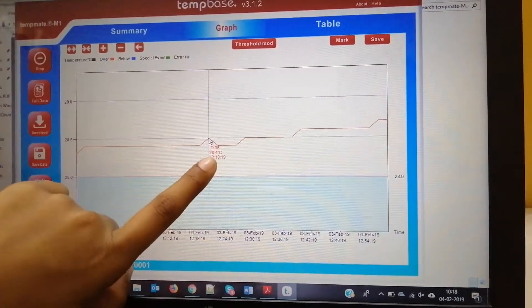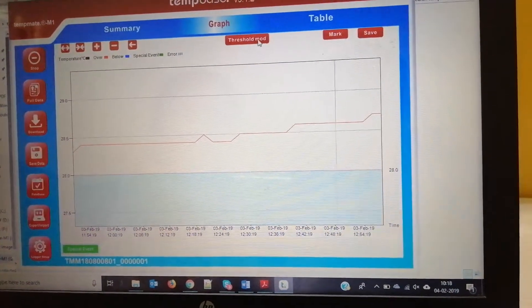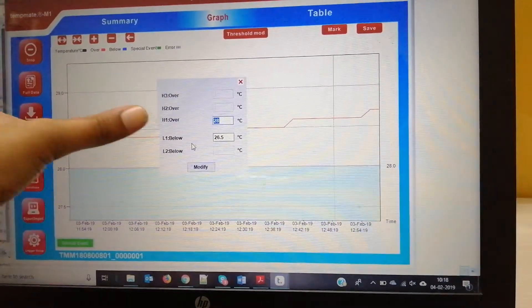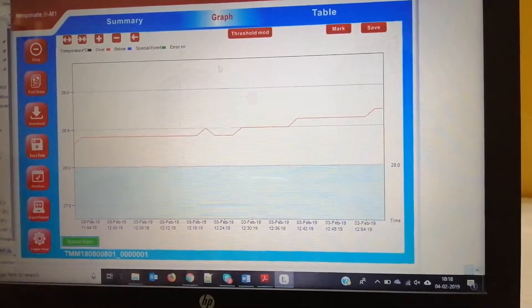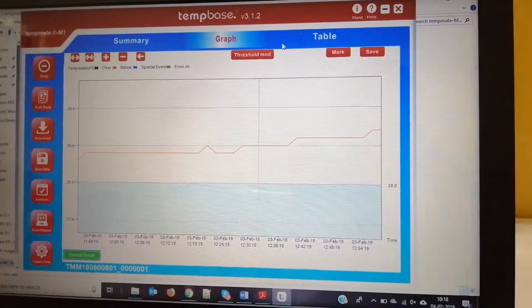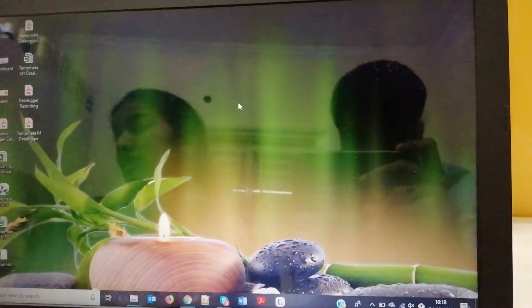This is the ID with temperature and time shown in the graph. Here you can see the threshold mode — what the higher set point and lower set point are. You can also save this graphical data. These are the software configurations.